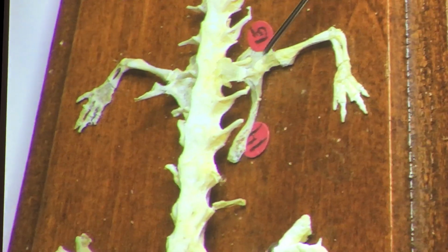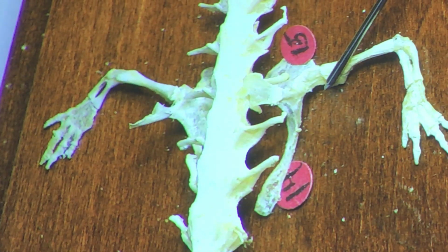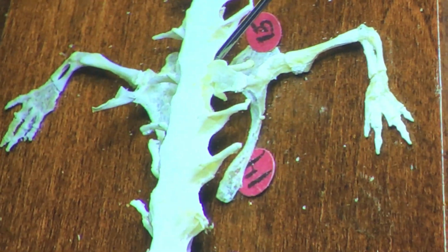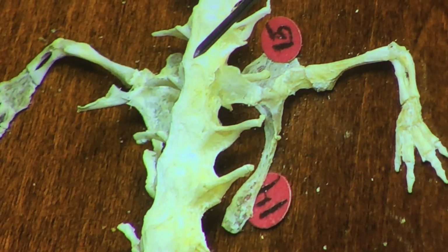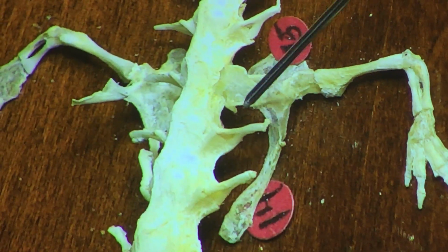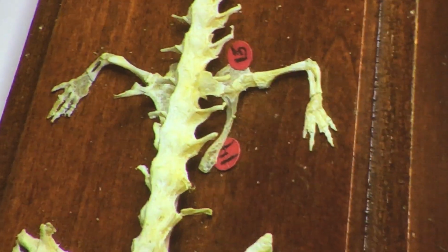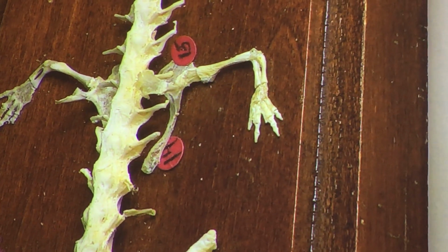The only bone we have is right here, and it's roughly hourglass shaped, and the humerus is attaching there. So we know what bone that has to be, right? Scapula. So there's our scapula. And then there's a little piece of cartilage on top of the scapula called the suprascapular cartilage. Does that make sense? So procoracoid, coracoid, scapula, suprascapular cartilage. For your kitty cat scapula, the suprascapular cartilage became the spine of the scapula, and the coracoid reduced in size to become the coracoid process of the scapula.